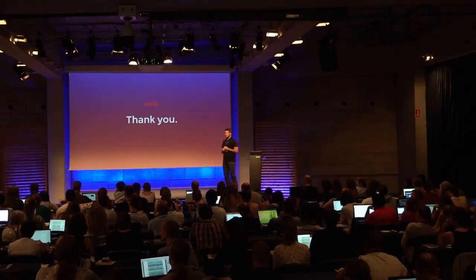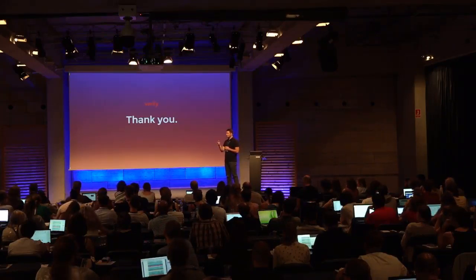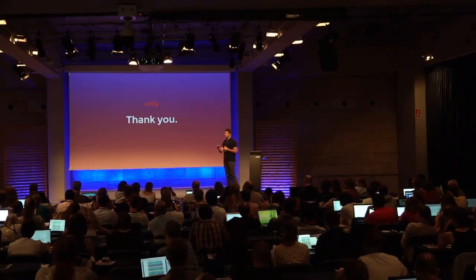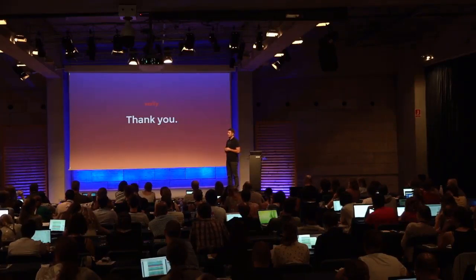We haven't, in terms of the number of identifications... well, by direct DIA, you probably mean the tool that's within Spectronaut? Okay. So we have compared that. The direct DIA usually doesn't perform that well. You will see about half of the number of peptides that you would see with DDA spectral libraries. So in our case, we can do much better than that.